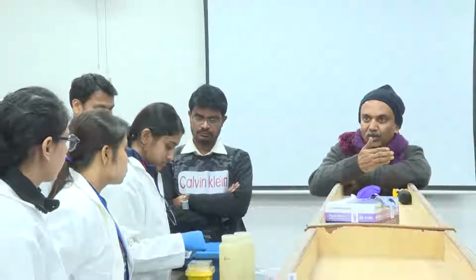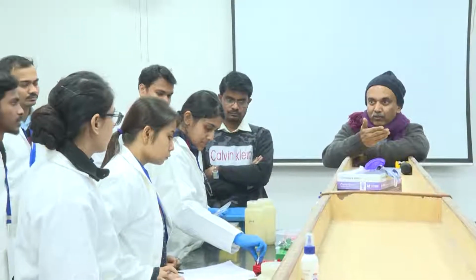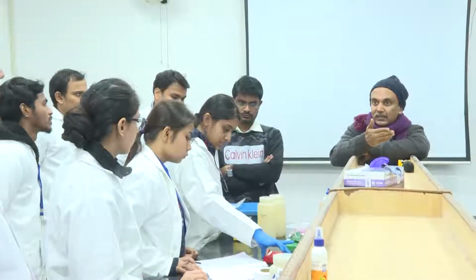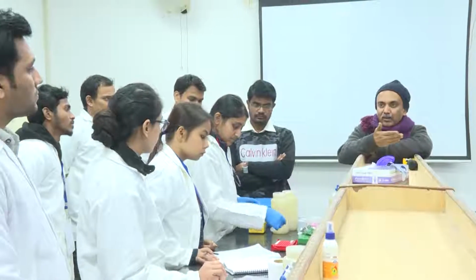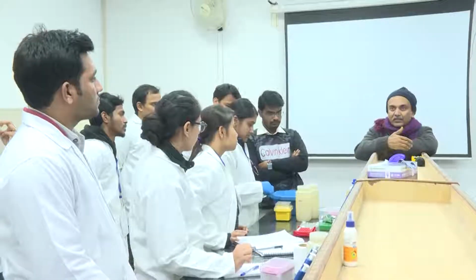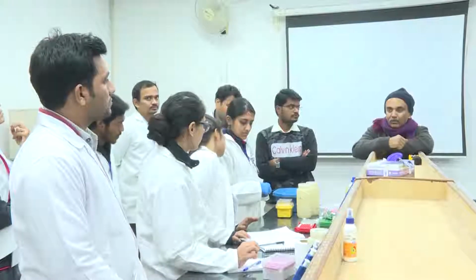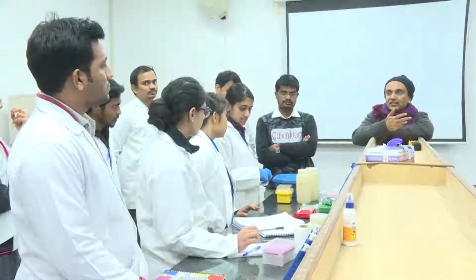So you are going to spend more time and more effort to quantify different groups of organisms simultaneously from a single sample. But if you are using molecular methods, from one sample, if you are able to extract DNA and you have sufficient quantity of DNA in your hands, how many are you able to quantify? As many as you could.